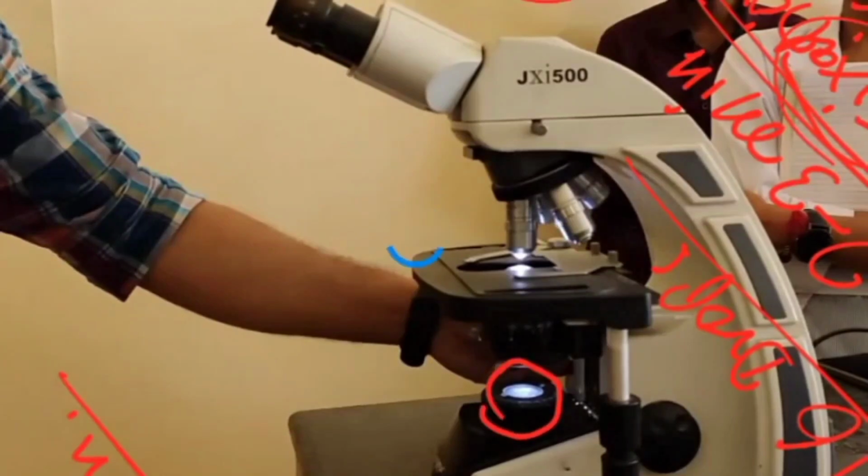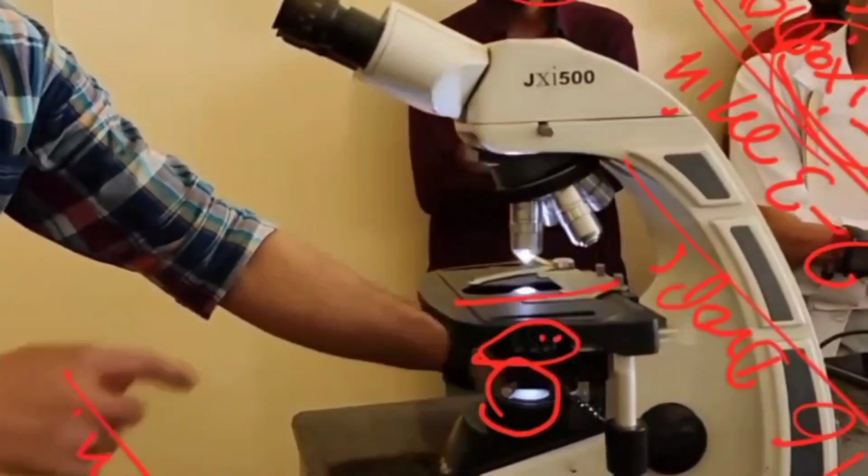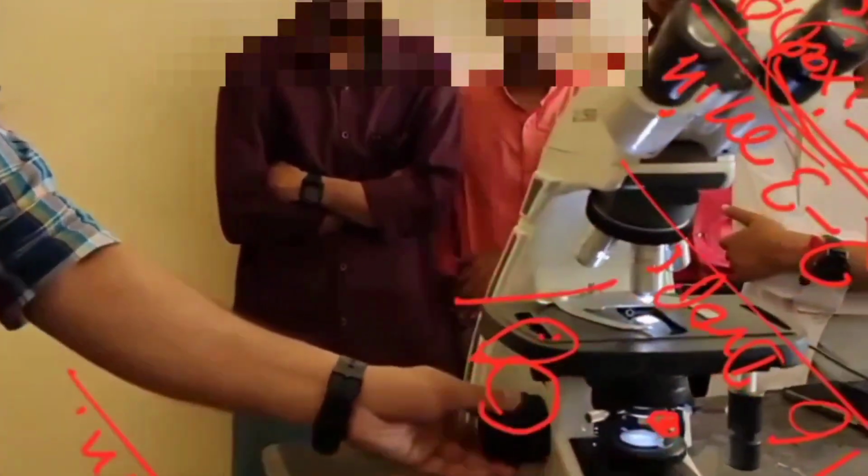This is the light source, this is the stage, this is the sub-stage where we can see the condenser and diaphragm to adjust the light, and this is the fine adjustment and coarse adjustment is here.